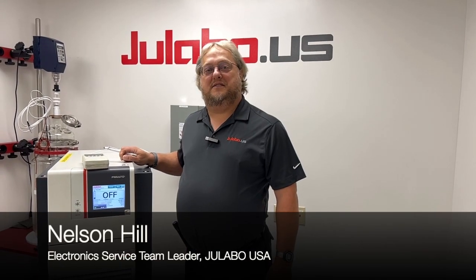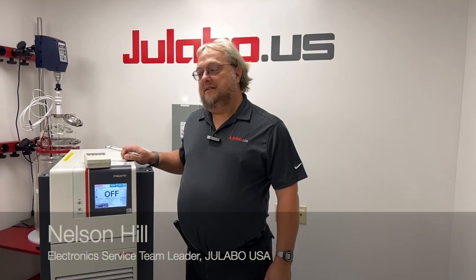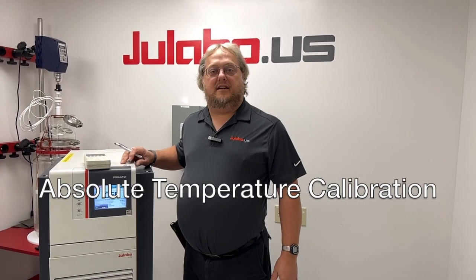Hi, I'm Nelson Hill, Electronic Service Team Leader here at JULABO USA. Today we're going to review the ATC on the Presto series. This would go for any Presto model from the A30 all the way up to the W92.